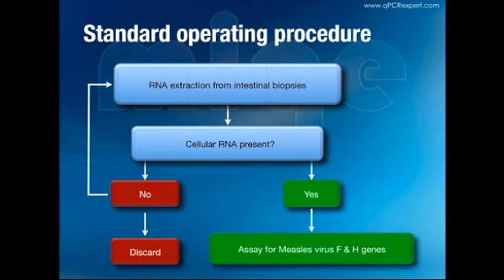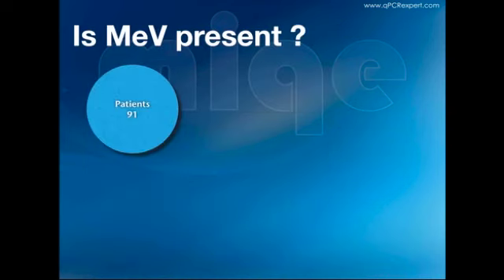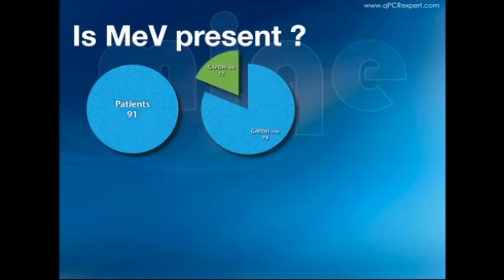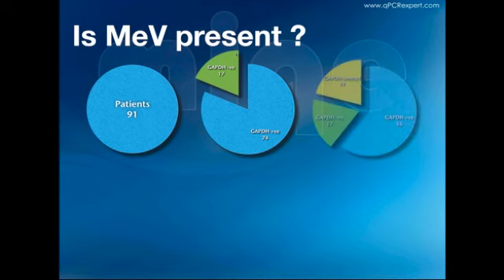The paper states that gene dosage correction was always carried out using GAPDH. In practice, they extracted RNA from intestinal biopsies, checked for cellular GAPDH RNA, and if not present, that sample was to be discarded. The SOP clearly stated: if no GAPDH is present, that sample is not to be used. When I was able to analyze their raw data, I found that of the 91 children reported, 17 were GAPDH-negative and should have been excluded, and in a further 19 cases I could find no evidence any GAPDH analysis had been carried out—leaving us with 55 samples.